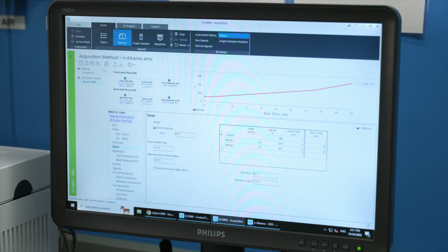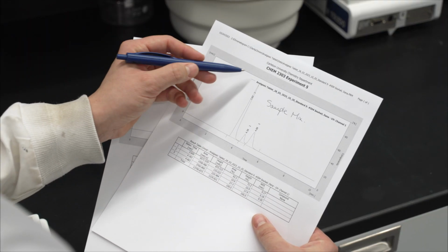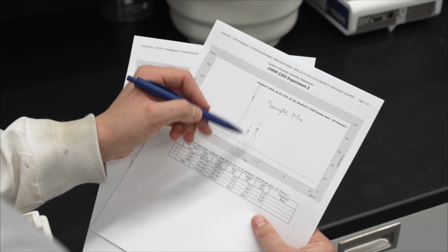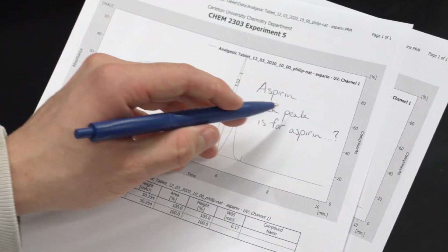Finally, take note of the elution times, peak shapes, and method times between the two methods you use in Experiment 4. It will be necessary to compare these two methods for your post-lab report. As for Experiment 5, keep an eye open for the amount of peaks present in your samples. There may be a peak that doesn't belong due to analyte degradation.